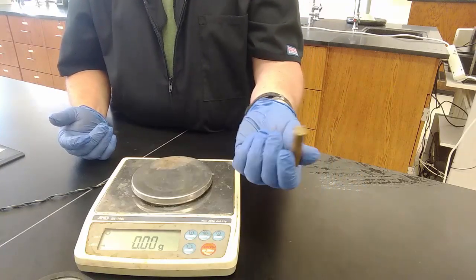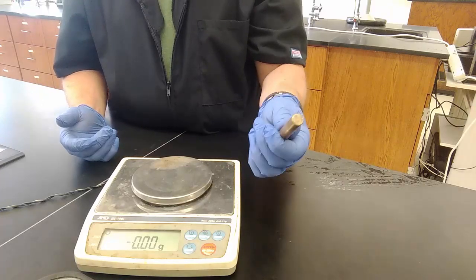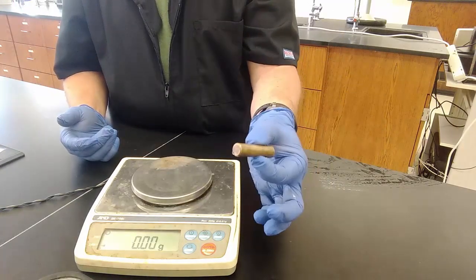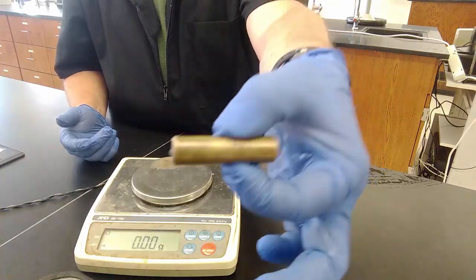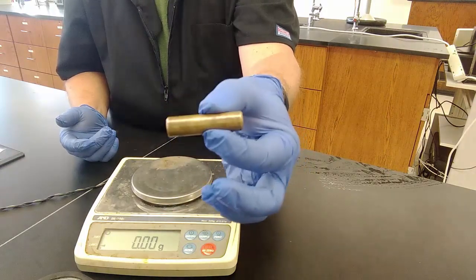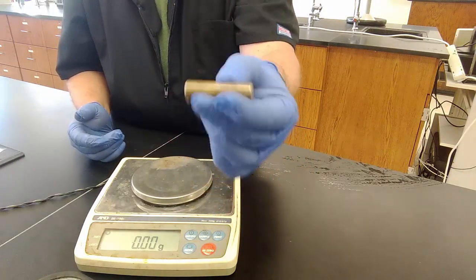Oh, I think that this is X metal because of the way that it looks. All right, well, this is probably not silver, right? It's also probably not gold because tuition here isn't high enough to buy a gold bar, okay? So it's probably not gold.